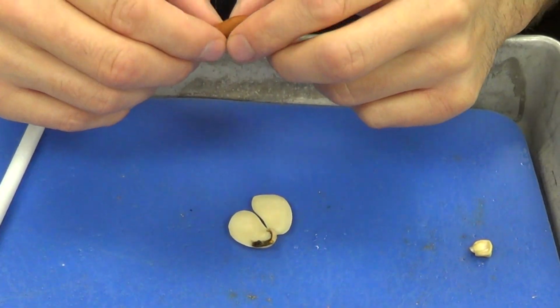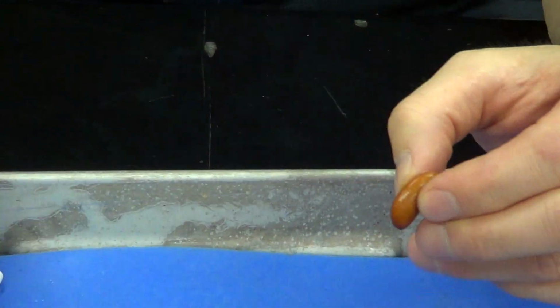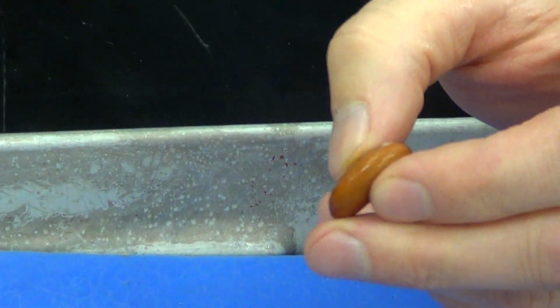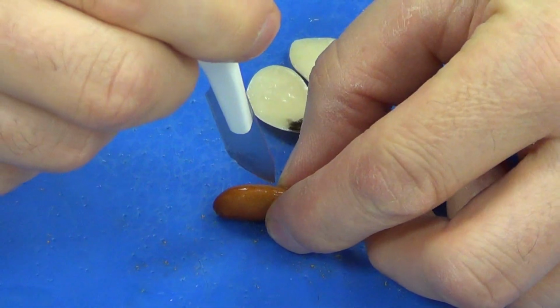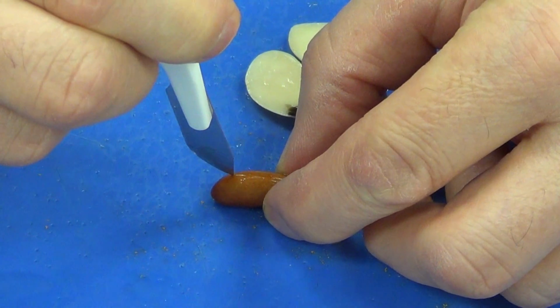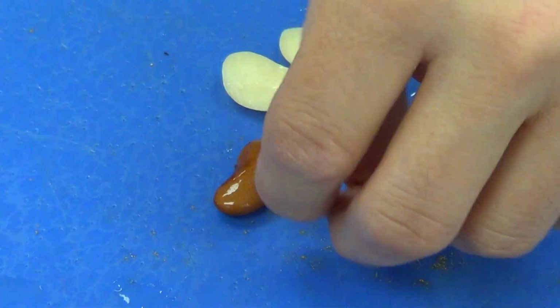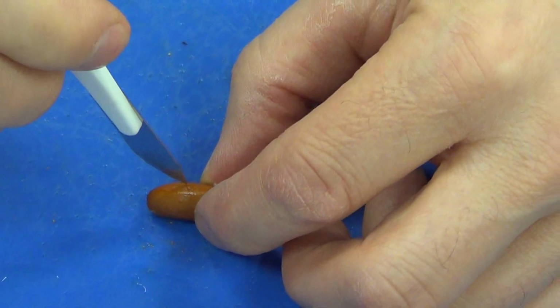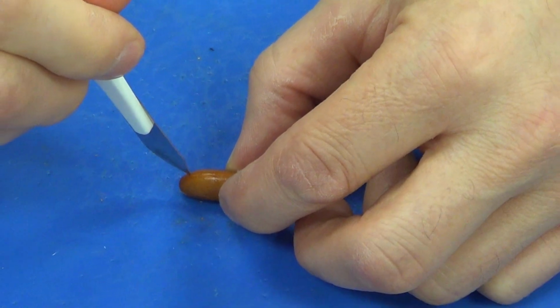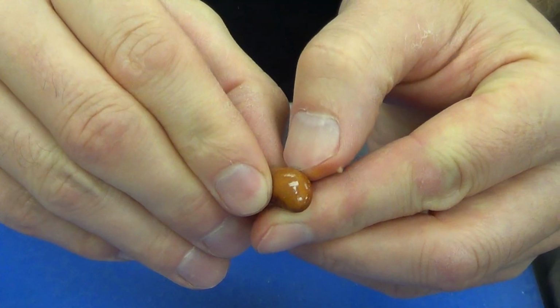Now lastly, I have a kidney bean here, and you can see if I pinch it a little bit, it's not going to come apart. So what I'm going to do is take the very tip of the scalpel, hold it like a pencil, actually put it in the tray, and just with the very tip of the scalpel, I'm just going to cut through that seed coat. I'm not going to go into the seed hardly at all. And that should be enough to peel away the seed coat.